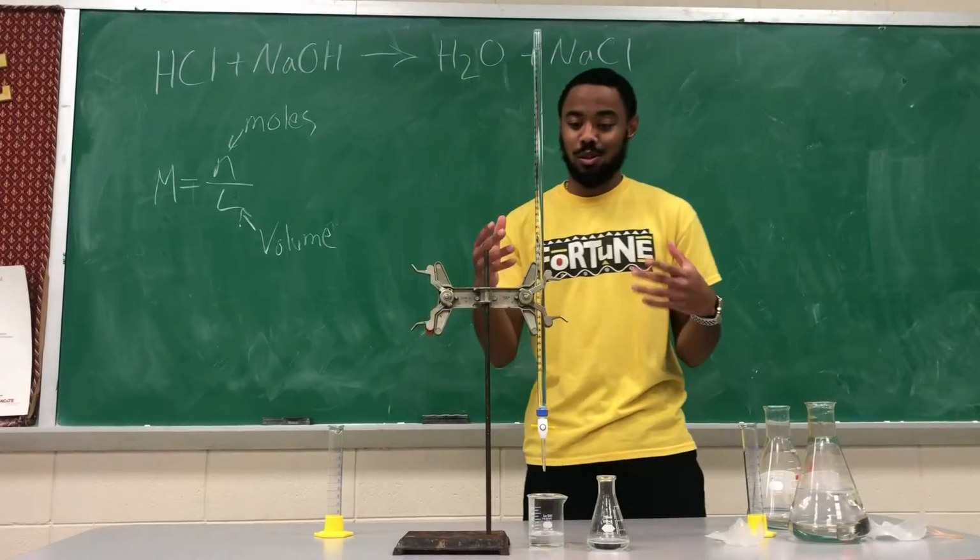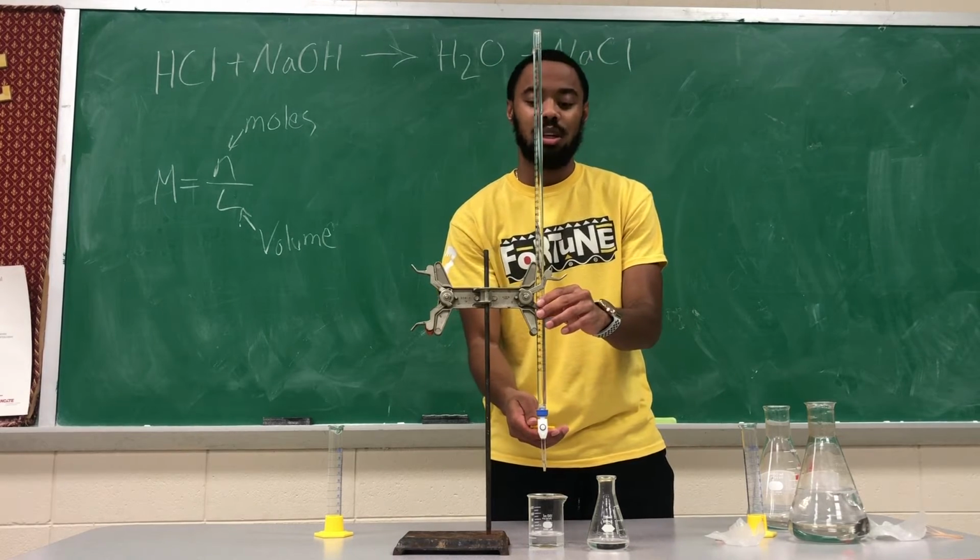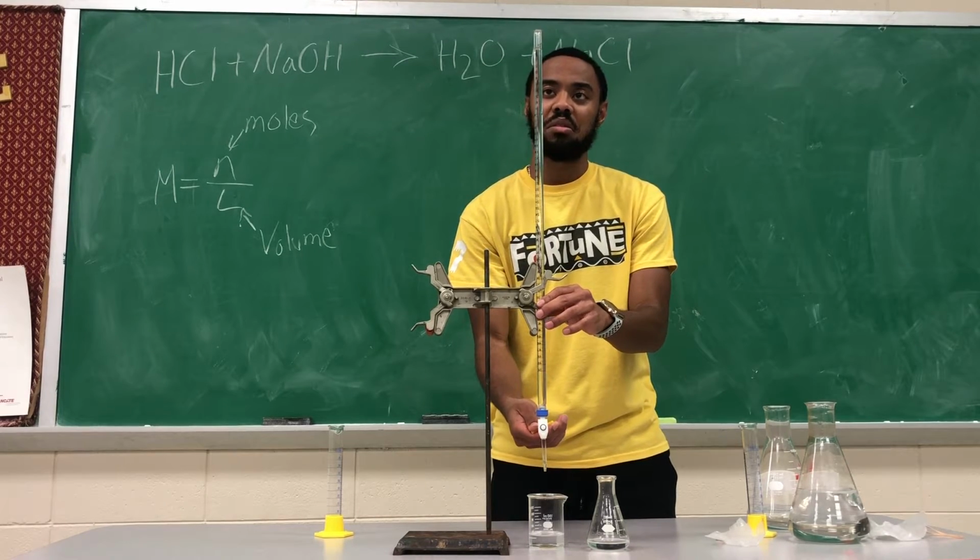All right. So now we're going to continue to try to get it even and to have your burette at 0 so that we have an accurate starting point. So we're just going to purge some of it.